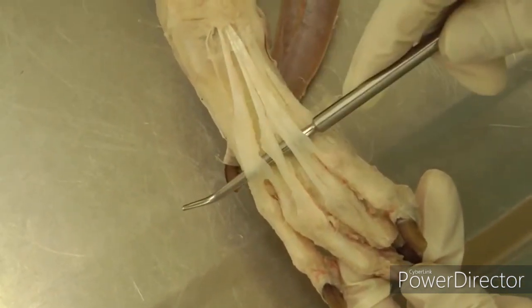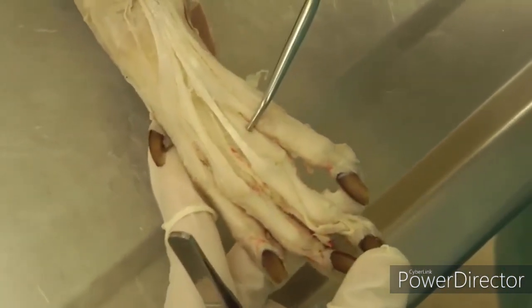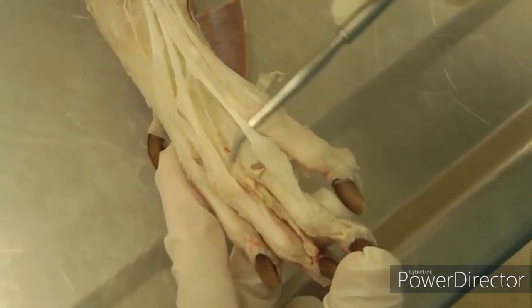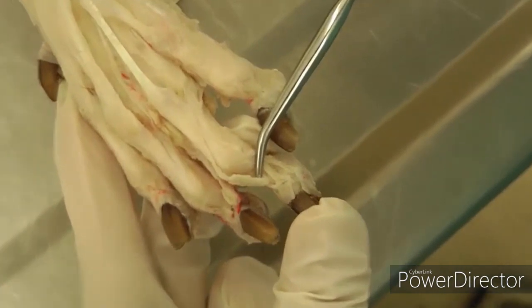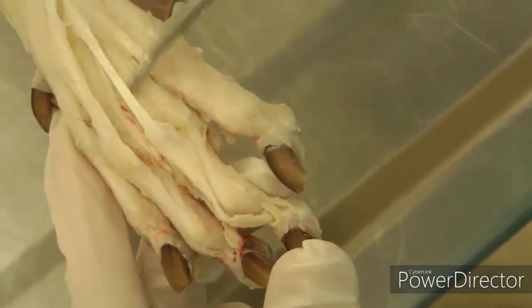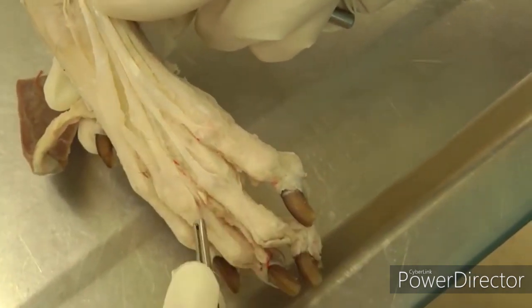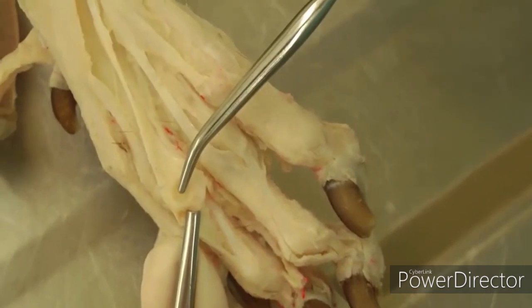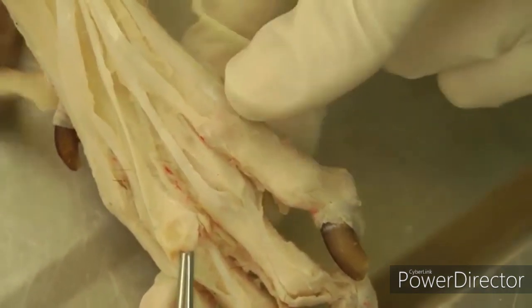It's extending all of those toes. If you want to pick a toe to work on, you can decide — I did the fourth toe. Pull it out and dissect it all the way down to see where it's inserting on that third phalanx. There's also a little sesamoid bone — about the size of the tip of the probe — right in there, if you can find that.